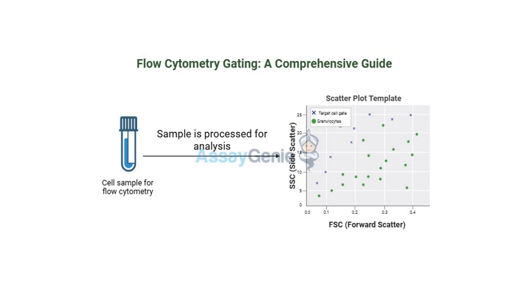Exactly. And each of those measurements adds another dimension to our data. So if we're measuring 10 things, we're working with 10-dimensional data. 10 dimensions. Whoa, that's a lot. I can barely imagine 3 dimensions. It's definitely hard for us to picture, right?